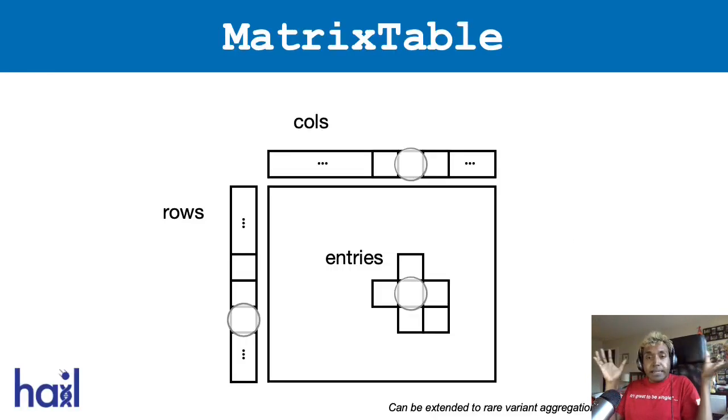So all of these file formats can be imported as a matrix table, because a matrix table has columns and rows, and the intersect would be entries, where the corresponding rows table stores all the row fields that are constant for every column in the dataset, and a corresponding columns table stores all the column fields that are constant for every row in the dataset. This is really two-dimensional because of the column-row intersect, which makes it really easy to index and call upon. The index is usually by rows and by columns, so upon indexing you would potentially have many fields for you to easily call and pick every time you need it.